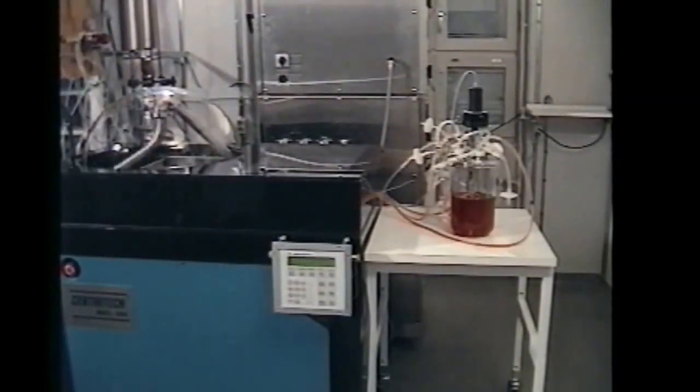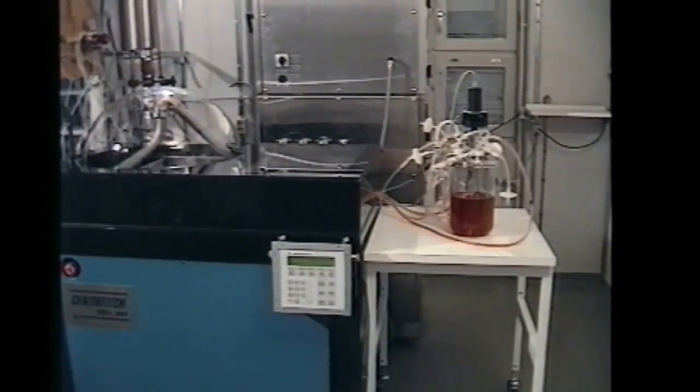A further benefit of the Centritech cell system is the flexibility of capacity. This system can be used for laboratory trials, then for pilot operation through to full production, thus eliminating the problems arising from equipment changes.